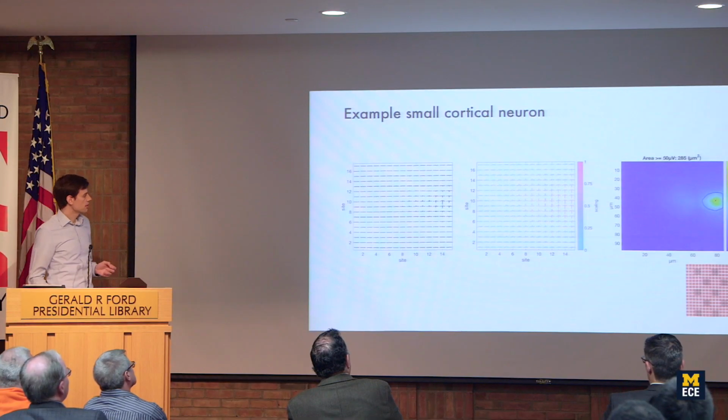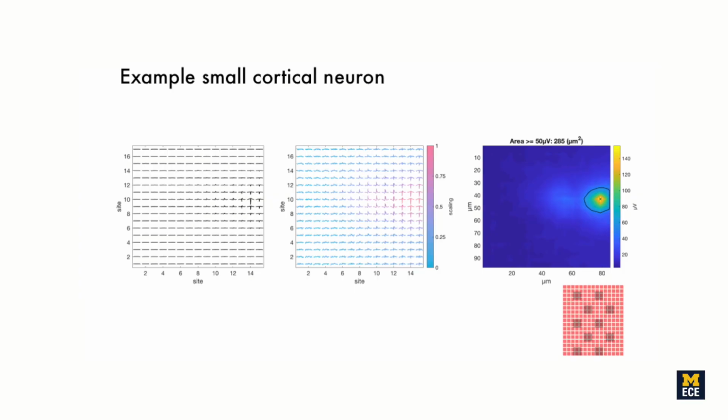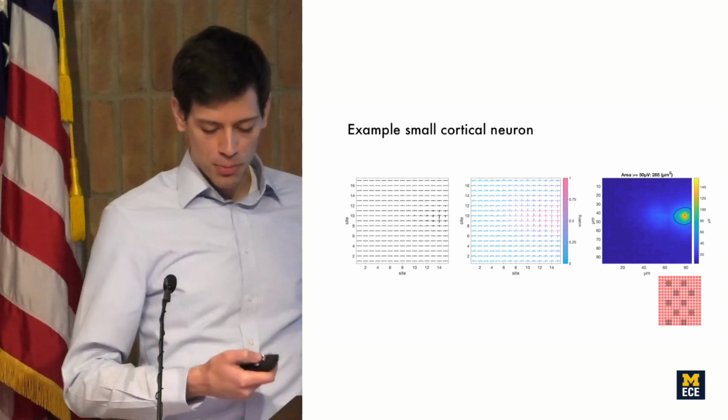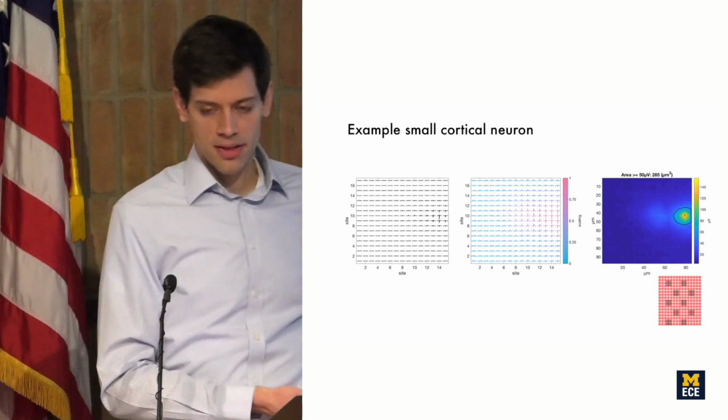Okay, but we also see much smaller waveforms. So here's a neuron that exists really only on a few sites. So even from the peak site to the neighboring sites, just 6 microns apart, this neuron already goes to nearly undetectable amplitude. And the spatial extent of this neuron's waveform clearly falls even in between the gaps of the NeuroPixel sites. So not only would you be missing these kinds of neurons in between those gaps often, but if there's any movement of the probe relative to the brain, or movement of the brain relative to the probe, then that neuron could easily become undetectable in a way that the CA1 pyramidal neuron wouldn't.